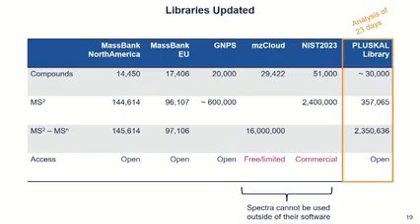And this is just a very quick update. So this is the data, or the libraries, that are now available. Of course, there are many more smaller libraries where you can get data, but I used the most used public databases like MassBank North America, MassBank EU, GNPS. Then we also included mzCloud because it's the biggest MSn library that we have, and then NIST 2023.